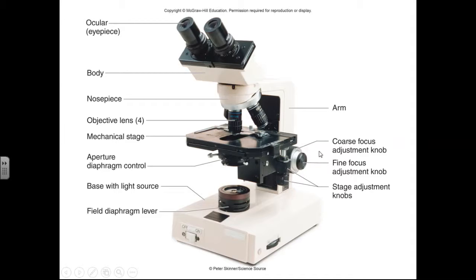To change our focus, we have the coarse adjustment and fine focus knobs, and then the stage adjustment knobs to move the specimen around on the microscope mechanical stage.